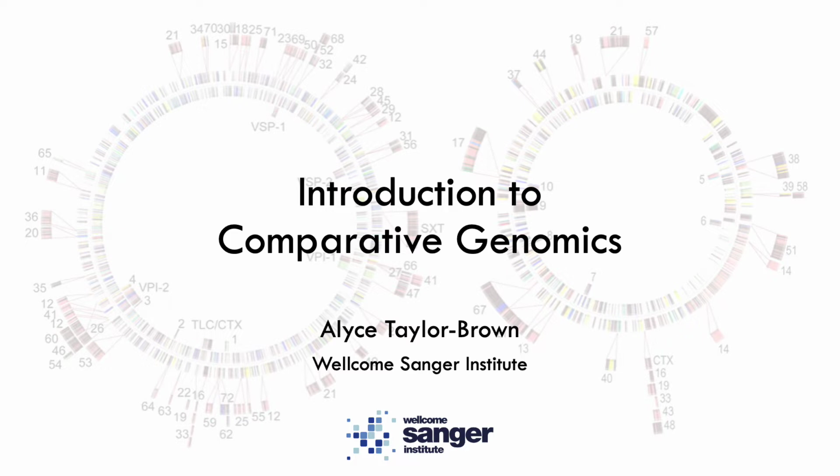I'm a postdoc at the Wellcome Institute, and I'm going to give a fairly broad overview to comparative genomics. I'm going to take you through a fairly generic pipeline or several pipelines to explain what to do once you've sequenced a genome.